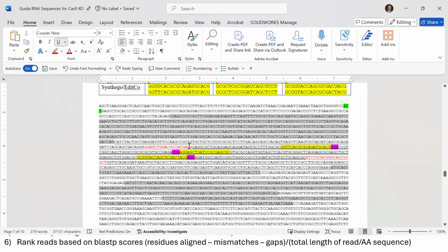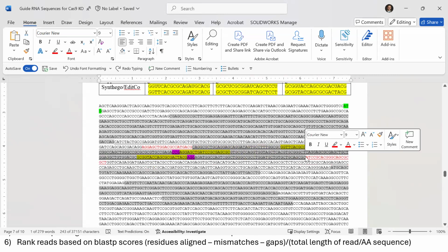that in every read, and then delete everything, including that sequence, and on the 5' end of it. Okay, so we can use that tool to remove all of this sequence, and then we can use that same tool to put in a different sequence and say this is a 3' primer adapter, or whatever you want to call it, and we want to remove that and everything to the right, or on the 3' end of that, leaving us with only this sequence in between.